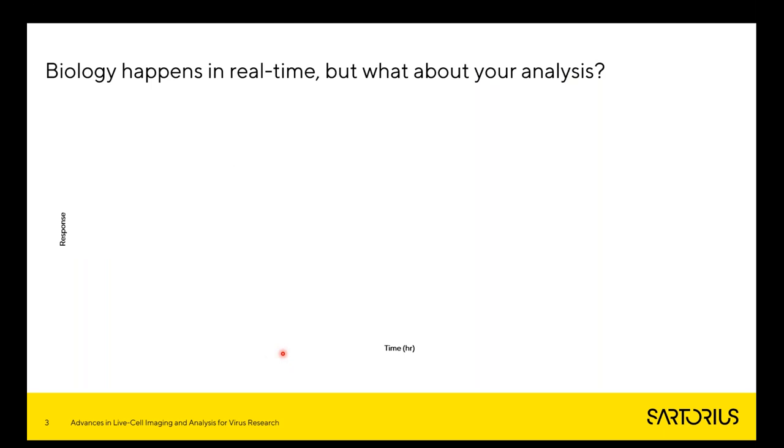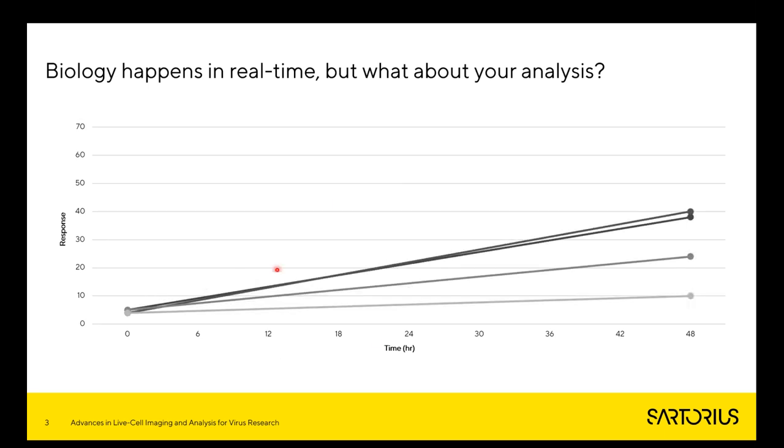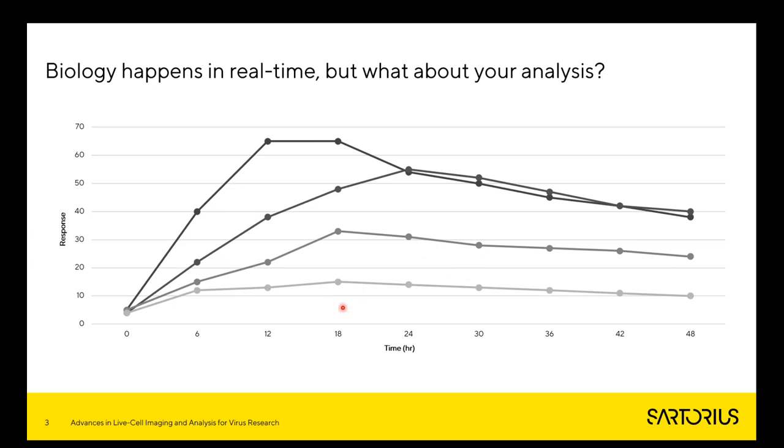Okay. So biology is something that happens in real time. However, traditional methodologies often rely on single endpoint measurements. And these single endpoint measurements often don't represent the true kinetics of the assay. With endpoint assays, you also miss out on these very important data points that happen in between. So therefore, going for more kinetic readouts basically allows you to capture these very valuable data points that would otherwise be missed out on. And also, let's face it, no one wants to go to the lab at 2 a.m. to collect these very important data points.